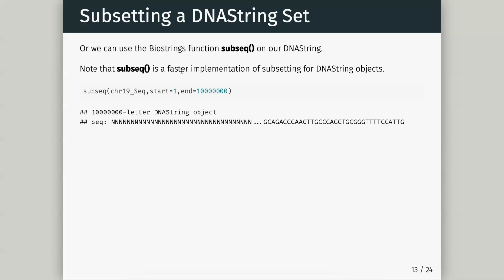So a very common thing we do is extract sequences under where we believe a transcription factor is bound, and then we look for a motif, a particular pattern. We will be using this subseq function when we get to it.